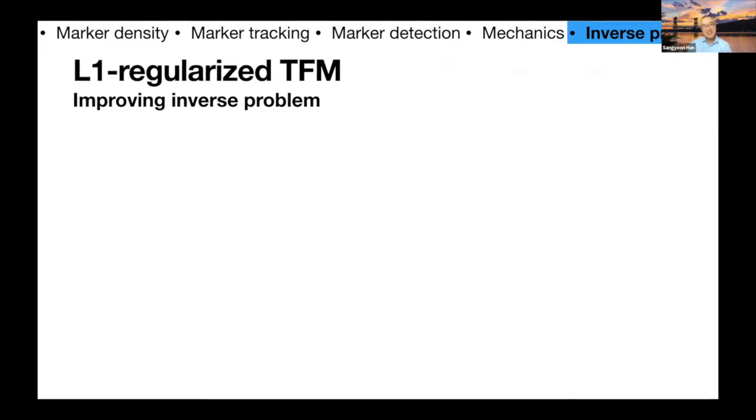In the engineering community and also the statistics community, L1 regularization is probably very common, but in the cell biology community, it was not. So my contribution to traction force microscopy, 7 years ago, was applying L1 regularization to the inverse problem in TFM.